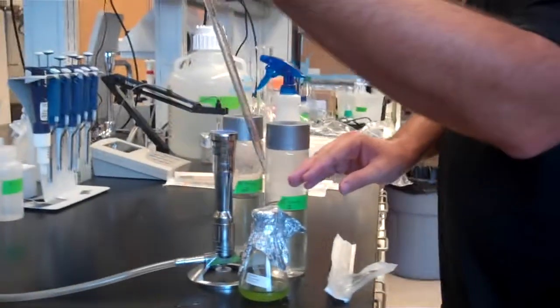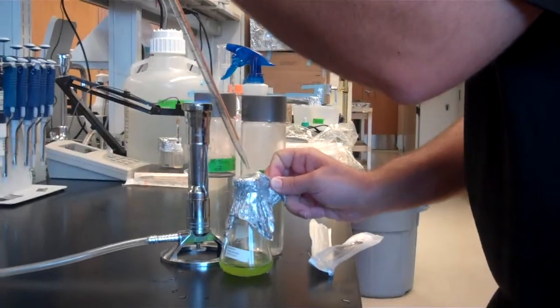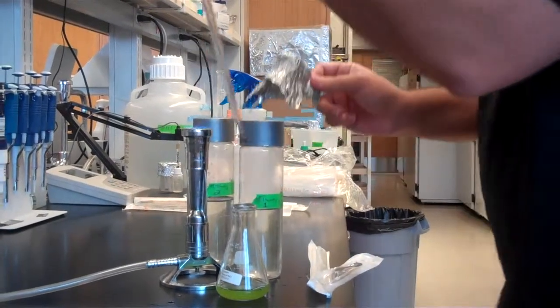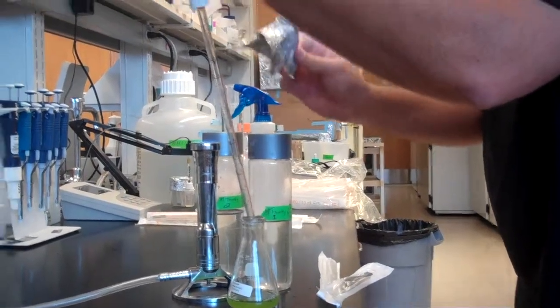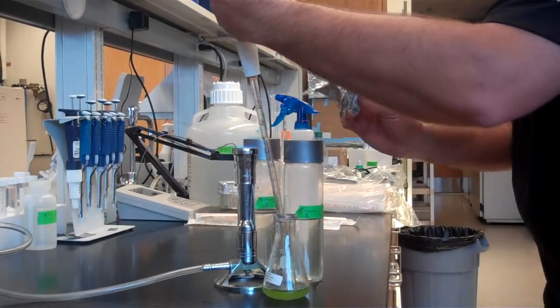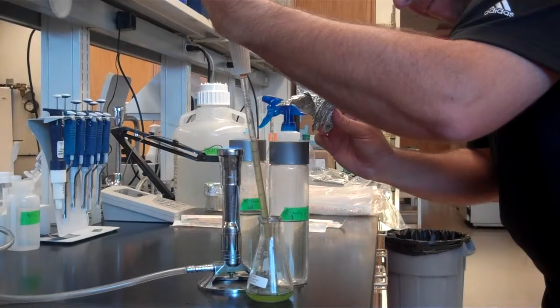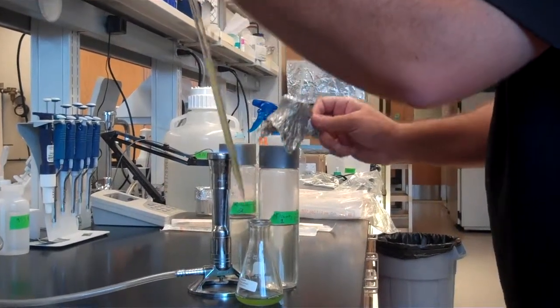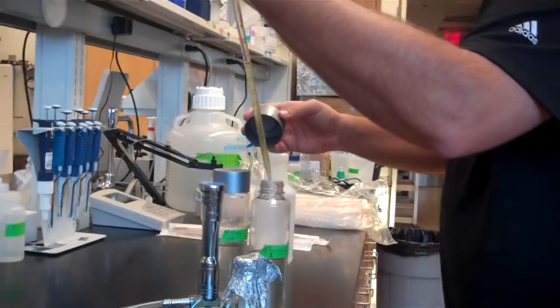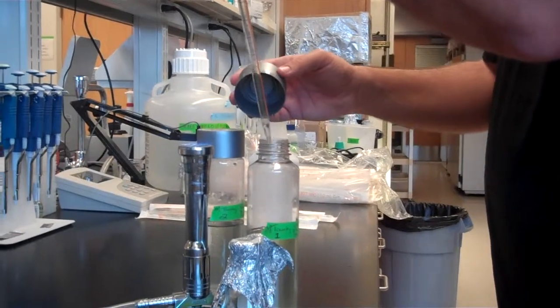Okay, so what I'm going to do is take 10 milliliters of the algae out and put it into the first bottle, keeping my hands and everything near the sterile field as much as possible. There we go. 10 milliliters, put that back on. I'm going to be very, very careful not to touch the tip of the sterile pipette to the water bottle, otherwise I'll need to grab a new pipette and start over on that one.